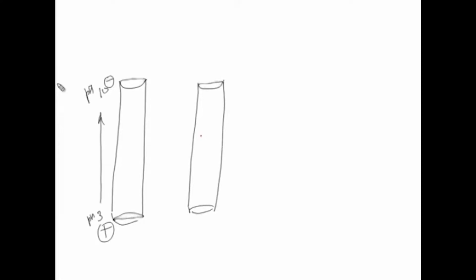Here you have to load your sample protein. Now, remember protein could be loaded anywhere, but it could be loaded on one side. You have a particular pH here, and negative and positive electrodes. When you load the protein and apply the electric current, this protein sample will migrate according to the pI values and settle down, or focus, at the particular site where the pH equals their pI value.